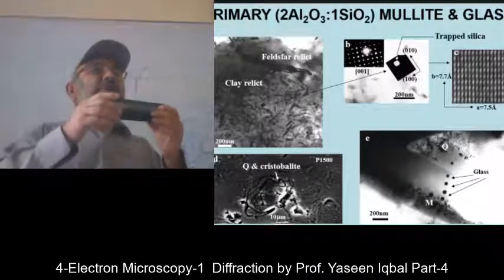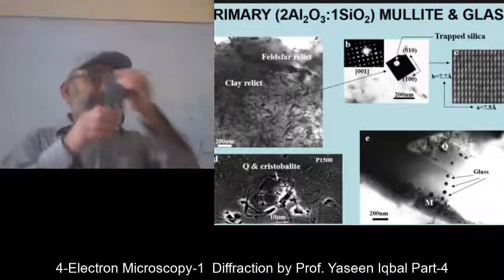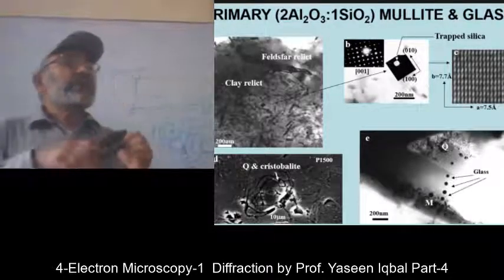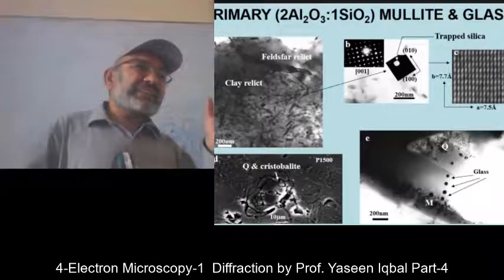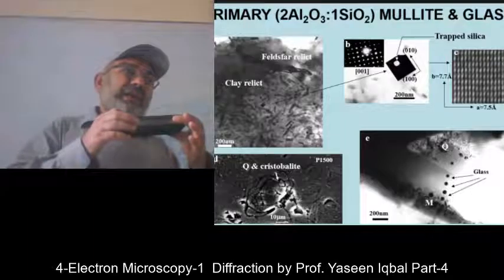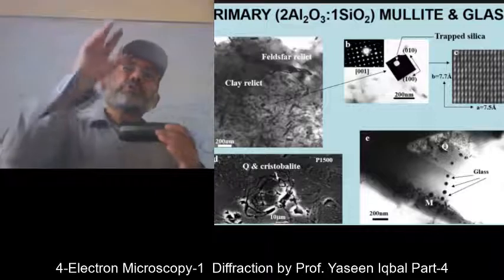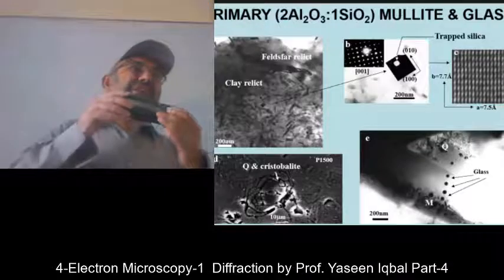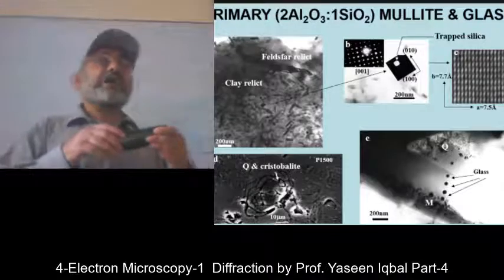It gives you two dimensions, right? Two dimensions are on the plane, and that can be taken as the third dimension if you could go up to 90 degree. But when you go to the fineness in the resolution, it limits your space. The higher the resolution, the more careful you are, your movement becomes limited. So nowadays, you cannot go beyond 30 degree tilt. 30 degree in this direction, 30 in this direction. So you can't go there.